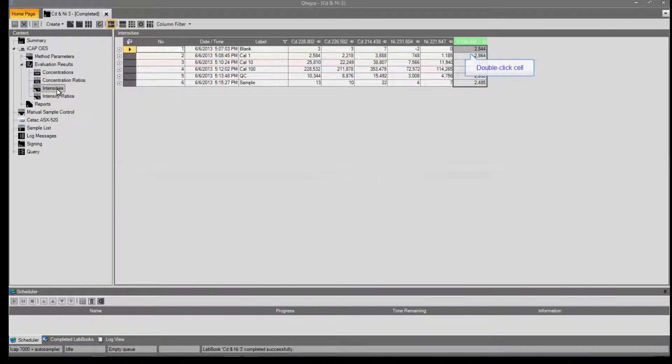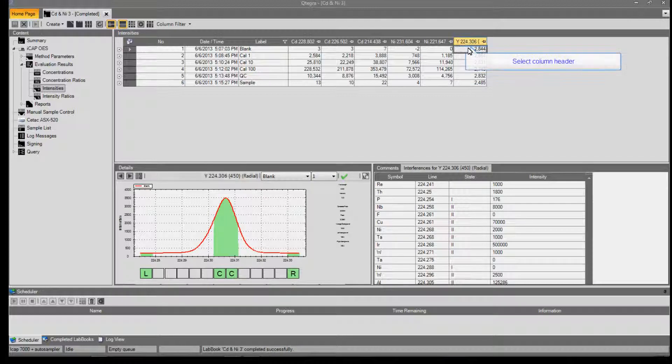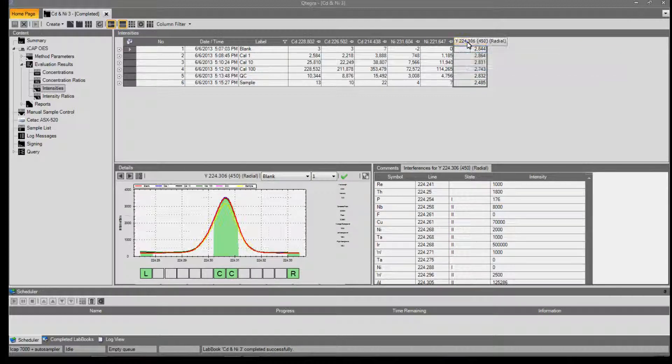Moving to Intensities, we can open up the subarray for one of the samples. We can use the column header to overlay all of the results.